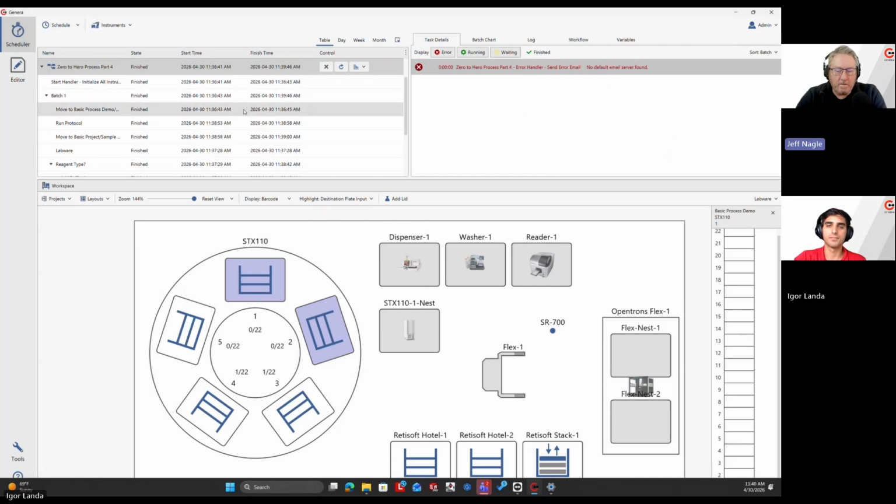Yeah, it's important to know that when we went to the reader and Igor made the change to put an electronic barcode on that plate, the instrument wasn't in error. The activity is requiring a barcode for that. However that reader may run, it may need barcodes. So that's why that is in the code, so he could make that quick change electronically. Now, physically, obviously, there's no barcode, but electronically, we've given it something. You could say error on there, and have that tracked in the recording of the actual process itself. But it kept the process moving.